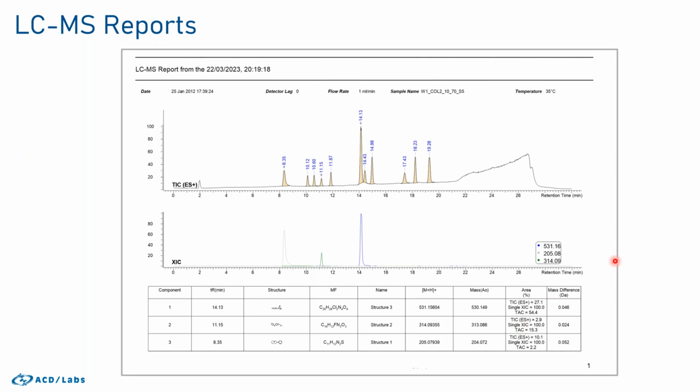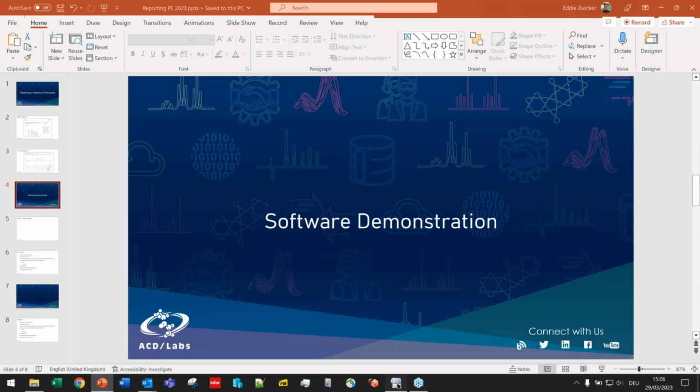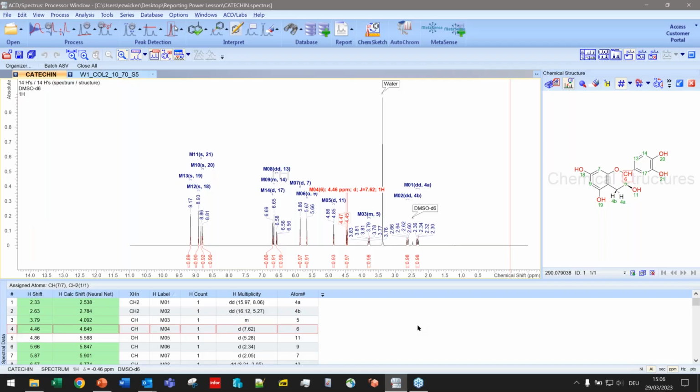So I won't even talk much more in terms of PowerPoint, but start right away with the software demonstration. I do have the processor open already in the background, so let me just swap the window. And Alison, can you just confirm for me that you can see the processor, please? Yep, I can see your processor window.